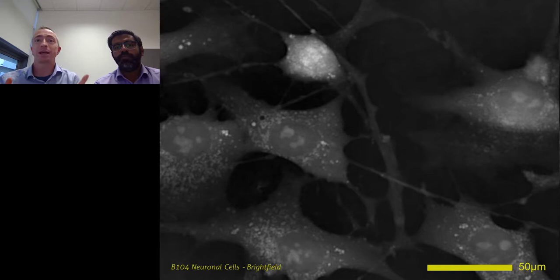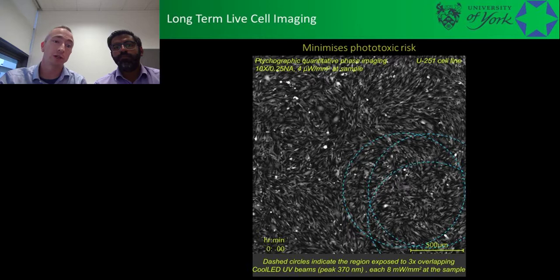If you look at the image you can see on the screen at the moment, you can see three concentric circles at the bottom right of this. So the very bottom one has been exposed three times to UV light. I know UV is never ideal, but still plenty of people do Hoechst and DAPI, especially Hoechst for live cell tracking. Go and use DRAQ5, guys, if you're doing that. Go and use something out in the red. But nonetheless, it's still commonly used, and any light is going to potentially cause perturbation to the sample.